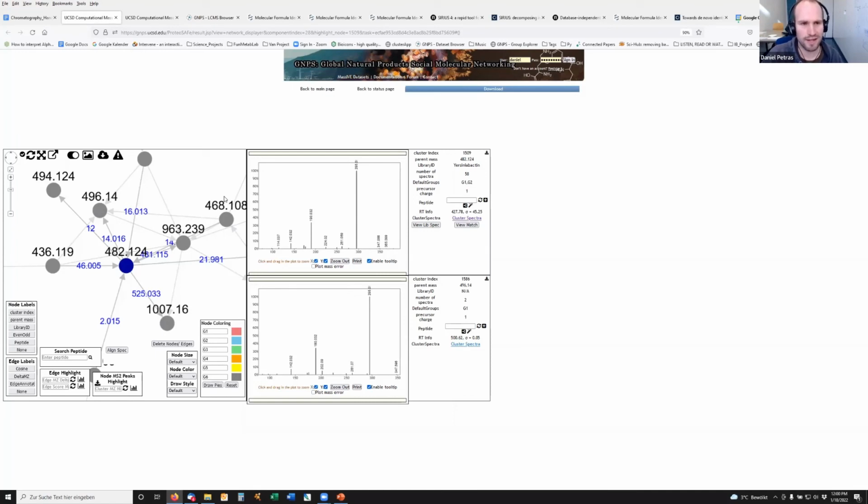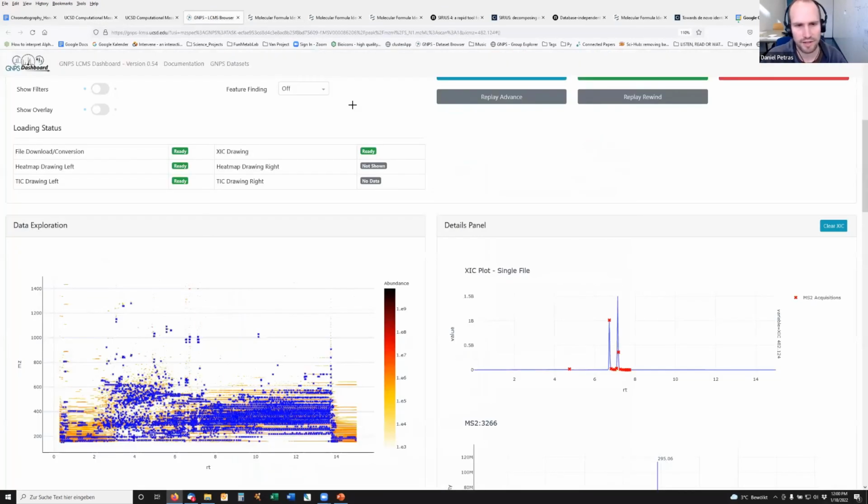Yeah, and it's not an isomer in the sense of a certain group being elsewhere, because then that typically would result in different MS fragmentation. But in particular, the example of Yersinia bactin, we have diastereomers. So they basically have two chiral centers, and they're not really distinguishable by MS. So this is one of the things we cannot do yet with MS, determining stereochemistry. But here with chromatography, those two diastereomers are very nicely separated. And we confirmed this downstream, and I know this, and we also have an idea how it happens.